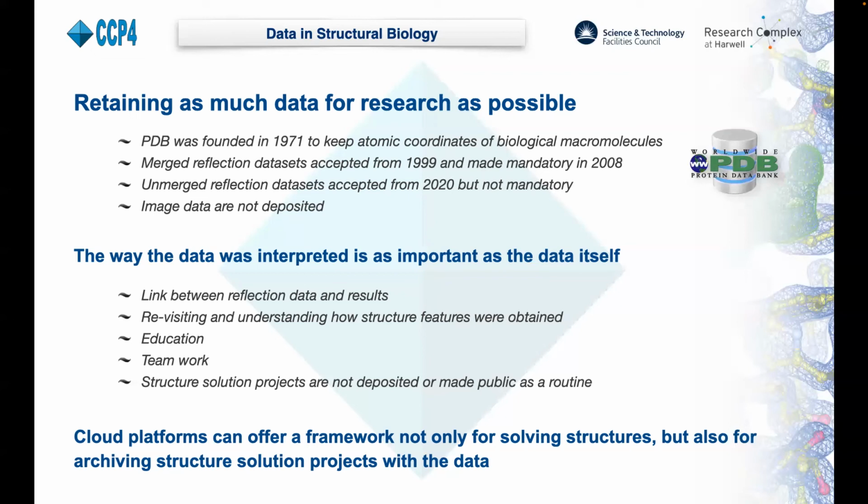And this is what a cloud platform can offer. I don't say that CCP4 Cloud in its current shape is an ideal tool for this, but I do believe that cloud solutions are the ideal instrument to retain as much knowledge and information as possible.